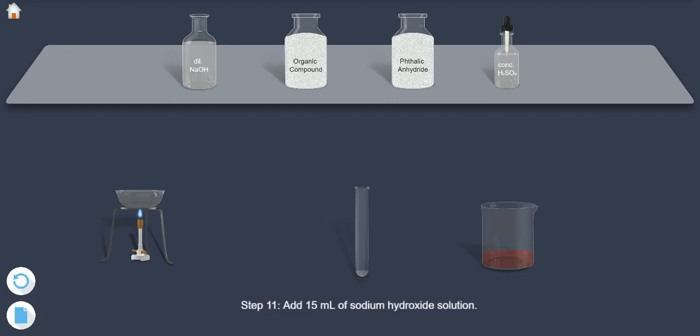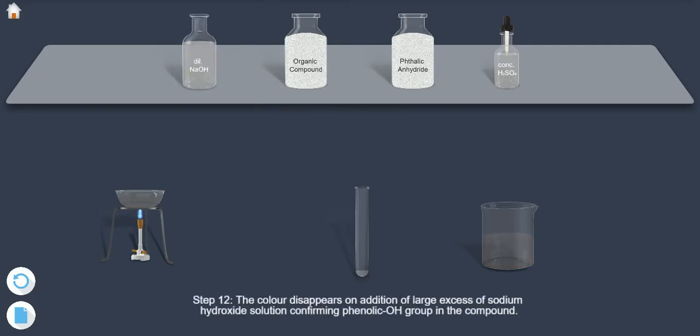Step 11: Add 15 ml of sodium hydroxide solution. Step 12: The color disappears on addition of large excess of sodium hydroxide solution confirming phenolic OH group in the compound.